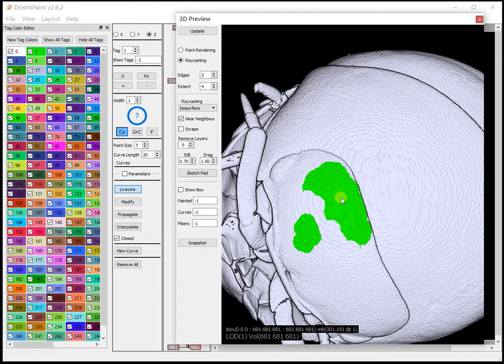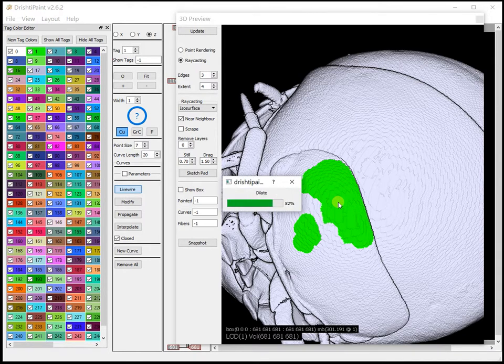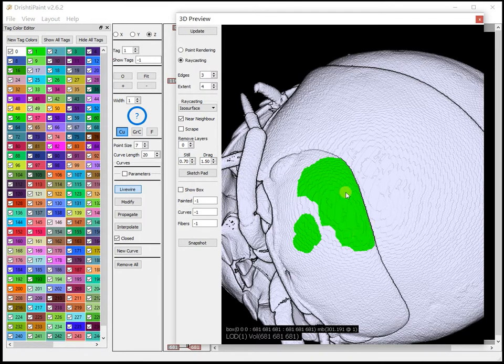Now hover over the region that you want to extend or dilate or erode, and then press D, in this case dilation. So D, so it is dilating by this value 4. Now you might have observed that when I press D, it's only this part that got dilated and not this one.